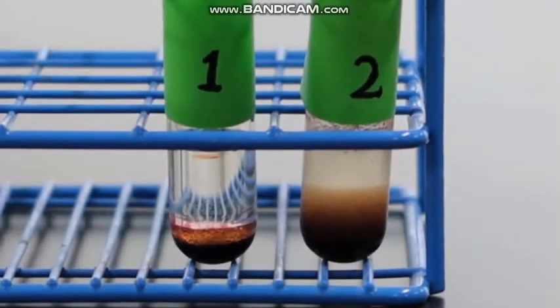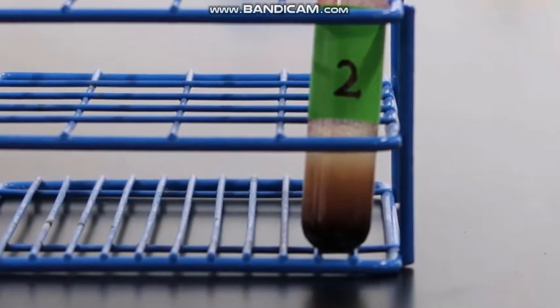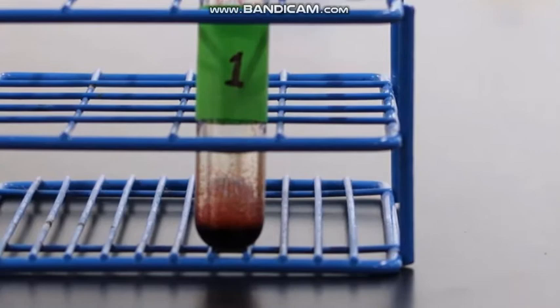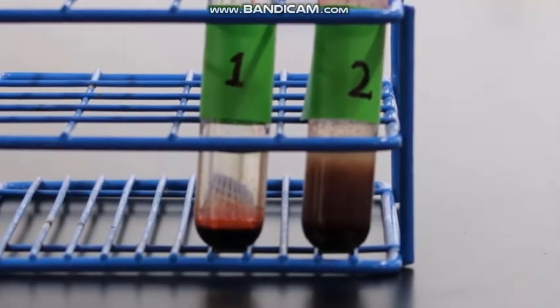At room temperature, the reaction between potassium permanganate and a double bond can take some time, so I've elapsed this video for about 45 minutes. As you'll see, one of these test tubes has definitely changed color over this time.